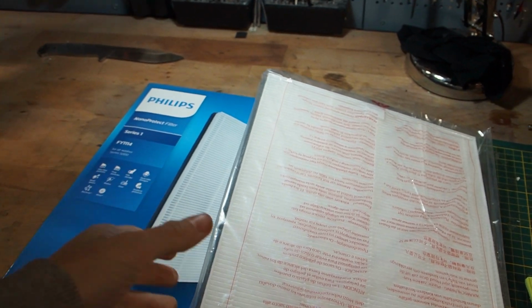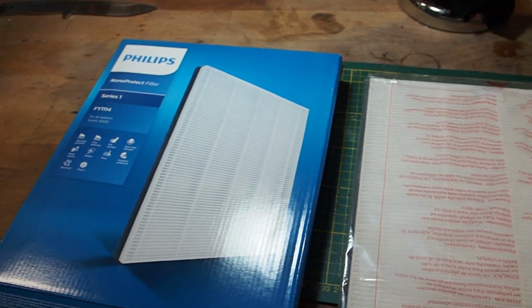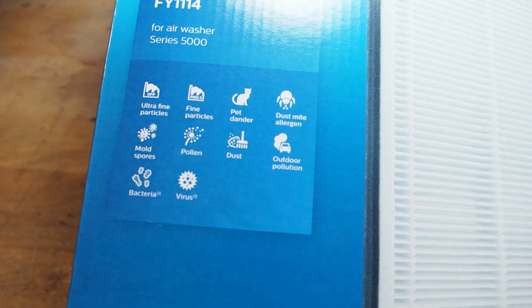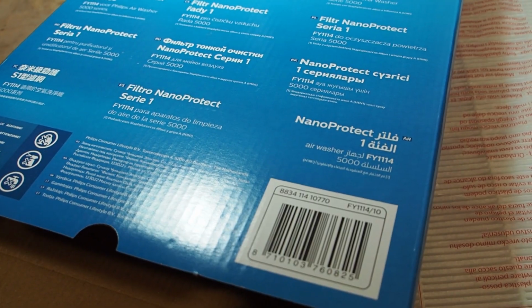Okay, and now I want to build a wooden frame for this filter here, which I purchased on Amazon. It cost me like 20 euros, and this is a HEPA filter. So it's filtering out everything from mold spores to bacteria, dust, viruses even. So yeah, that's a pretty good filter.